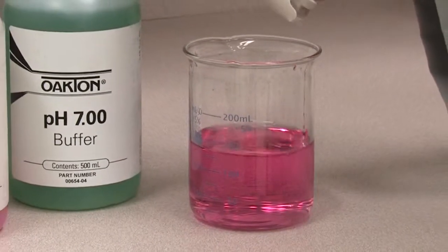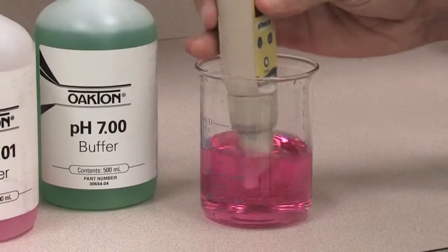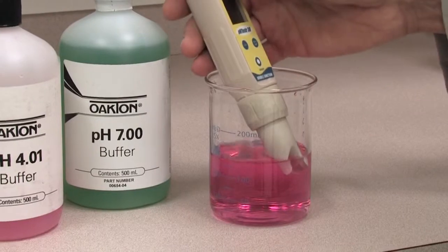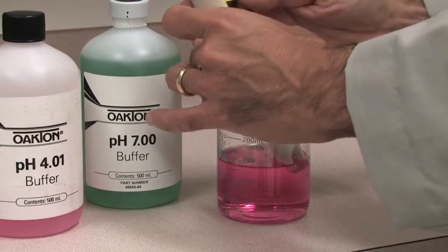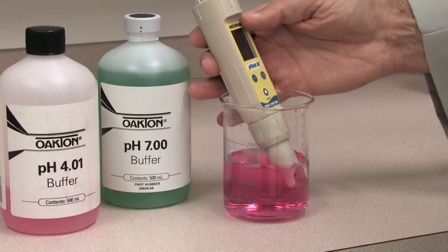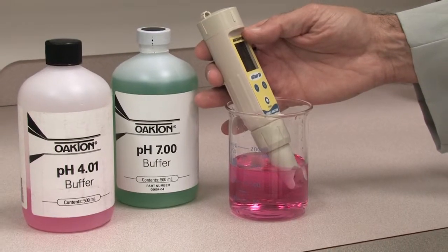Always check your tester by calibrating. If it calibrates to buffers, it can be used to take measurements. When it cannot be calibrated, even after attempts to condition or clean it, the pH sensor module must be replaced.